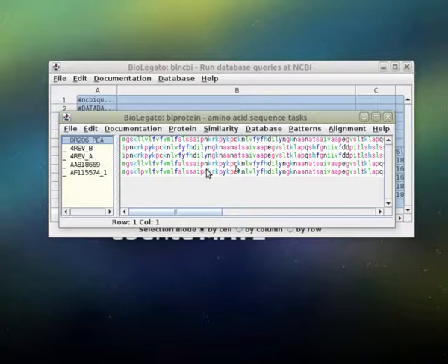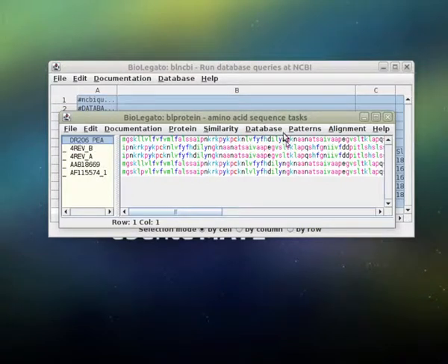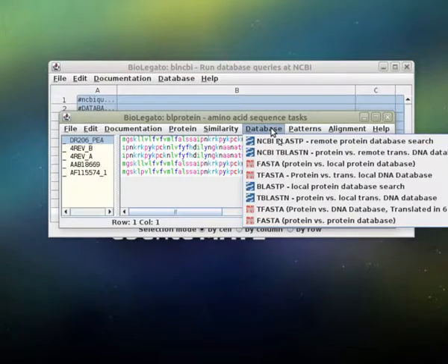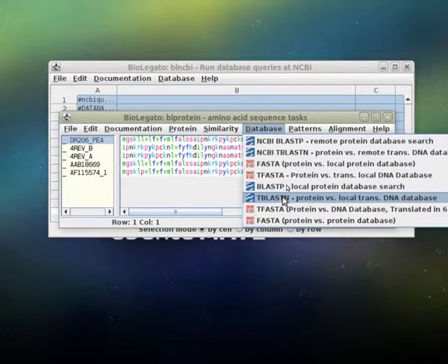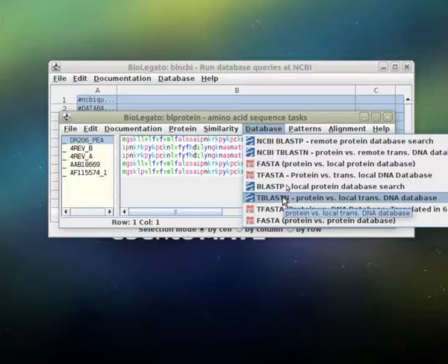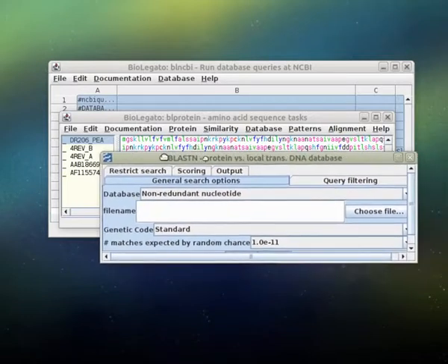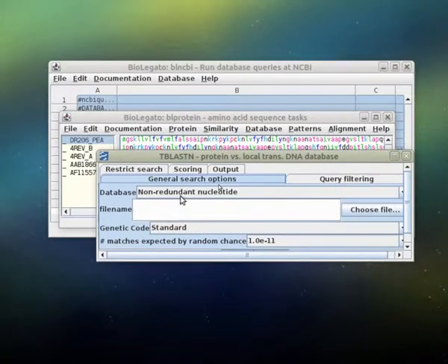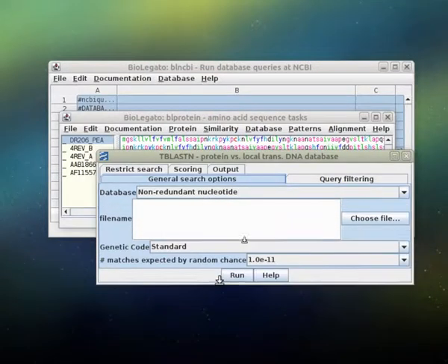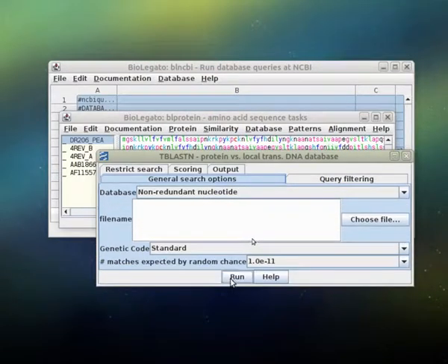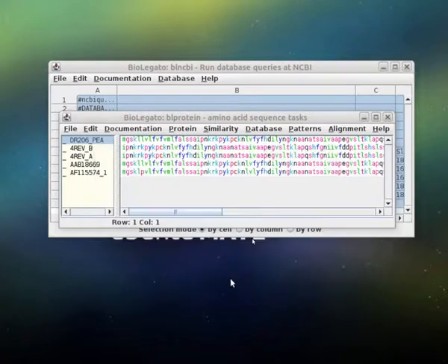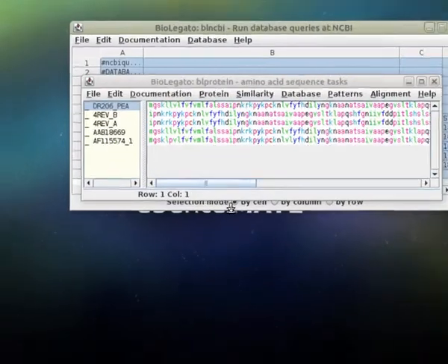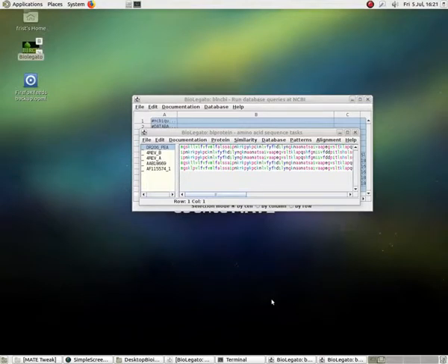BL protein is a BioLegato application specifically for working with proteins. To do our BLAST search, we'll choose one of the proteins, and we have a couple of options because we could either do the search at NCBI or on a local copy of the BLAST databases. Since we happen to have a local copy of the non-redundant nucleotide database, that's what we're going to search using tblastn. We will launch the search just using the run button, and I'm going to edit out the time that it takes to run.